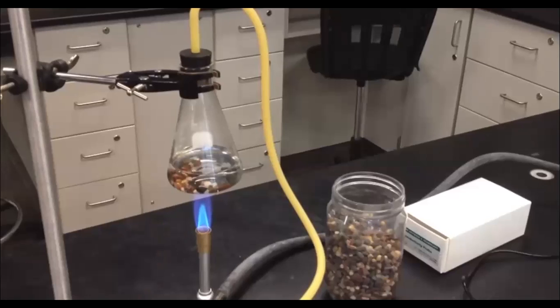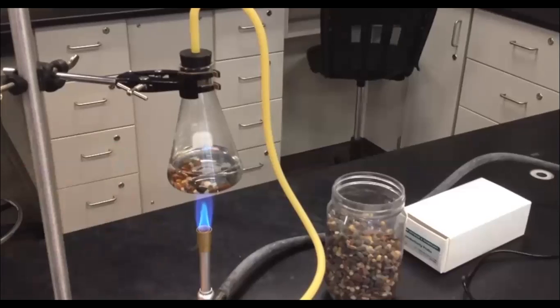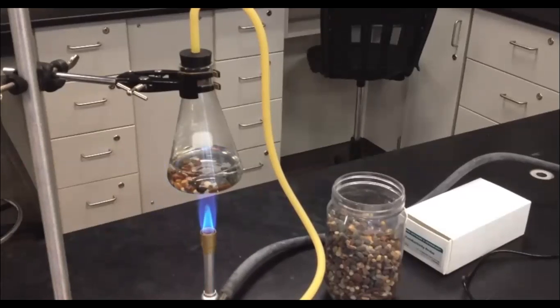If they do get out of hand and this boils over too much, you're going to contaminate your test tube. What you're going to want to do right away, if things get out of hand too quick, is probably just move the Bunsen burner out from underneath the flask. Then obviously, you can start taking time and making adjustments on the flame.